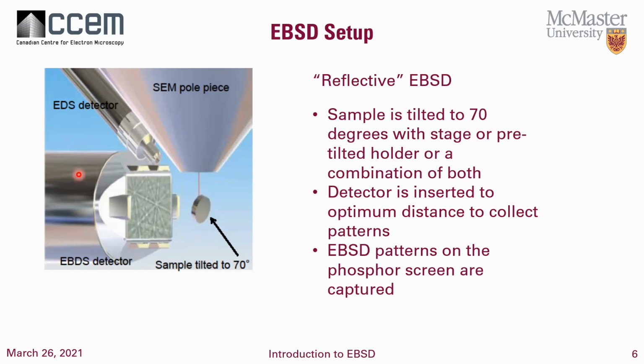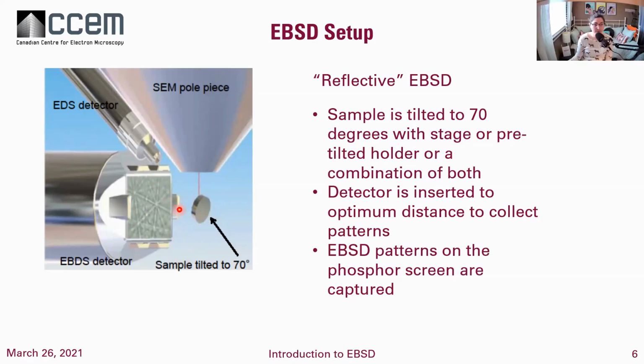Well, the phosphor screen is here. The camera's back here. The backscatter electrons are hitting the screen and producing the pattern on it. So this is inserted in.